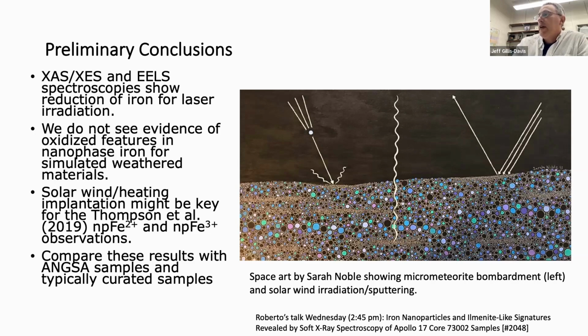of curation. So our next step is to compare these results of the laser weathered material with some of the typically curated and ANGSA curated samples to see if we see similar features. And with that, I'll just take any questions or comments. Thank you.